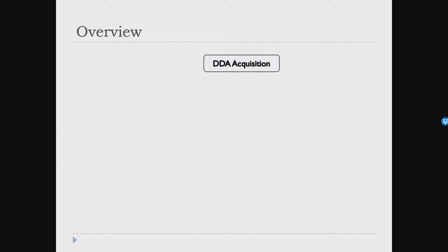How many of you know how good it is? You just built the library. What's your assessment? Is it a good library? Is it a bad library? Does it have any issues? So you don't know yet, right? But with Skyline, you can get some sense of what the data you're putting into your library is like. And so Skyline is capable of starting with DDA acquisition.